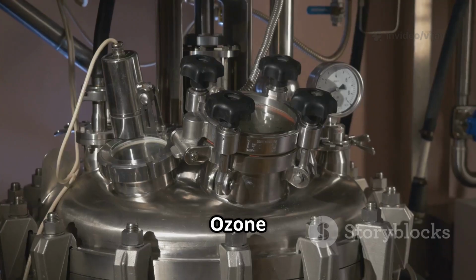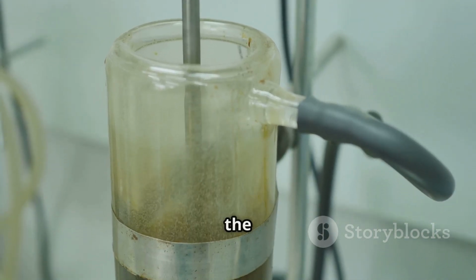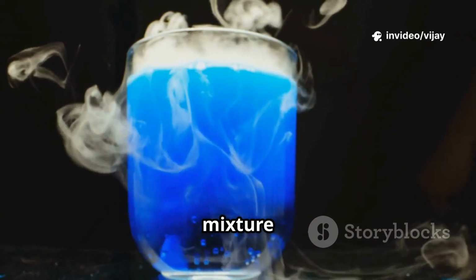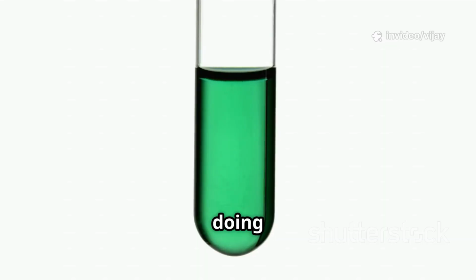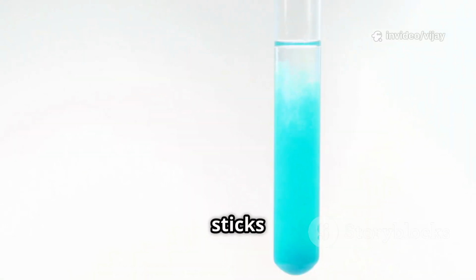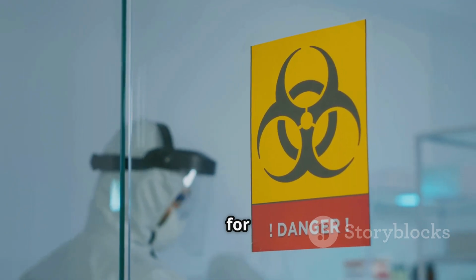Step 2. Ozone time. Turn on your ozone generator and gently bubble ozone gas into the solution. You'll see the reaction mixture start to take on a pale blue tint. That's your sign that ozone's doing its job. When the blue color sticks around, you know you've got enough. Don't overdo it. Extra ozone is just asking for trouble.